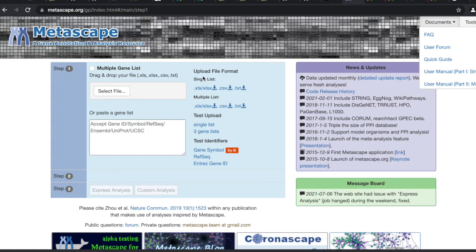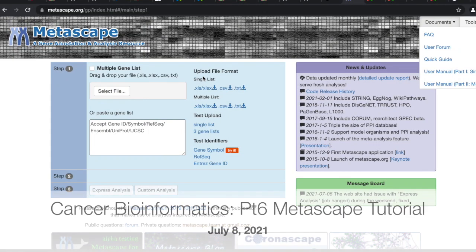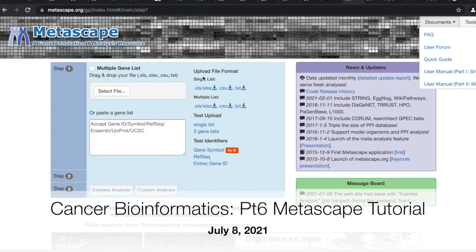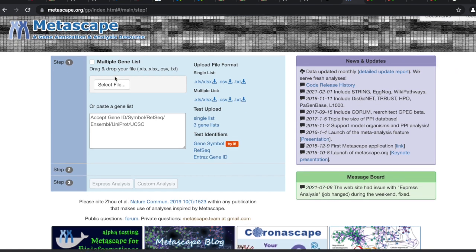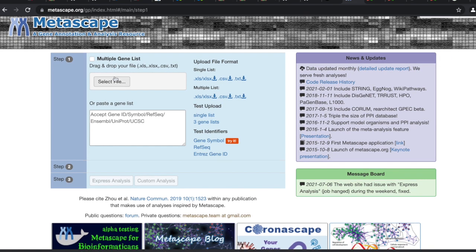Why don't you all type in — those that want to stay — type in Metascape. And you should get to this page here. Is everybody on this page?